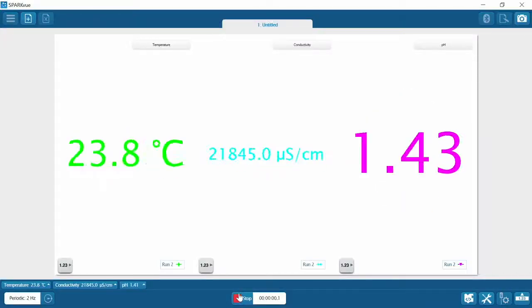That's because the limit of detectivity of the sensors is much lower, so we had to make dilutions of them. So these are 0.1 molar solutions. For our acid, let's get our numbers down here. And just for regularity's sake, I'm going to wait about 10 seconds before I do my final readings.